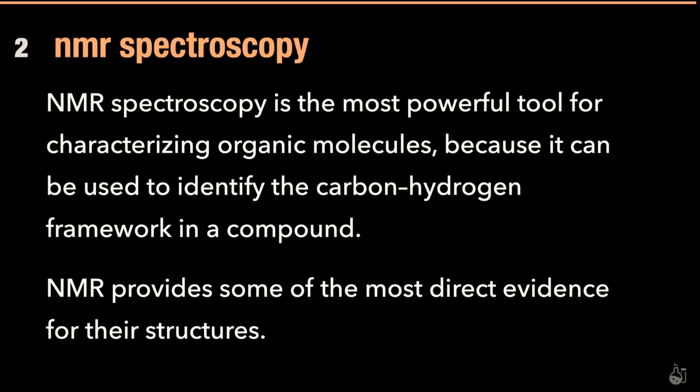The reason NMR spectroscopy is so powerful is because it gives me almost a complete picture of the organic molecule. Without having to do functional group tests using reactions or infrared spectroscopy, I can know not only the functional group, but even the alkyl groups, the size, the number of carbon atoms, everything. That's why NMR is so complete. It provides the most direct evidence for the whole structure of a carbon compound.